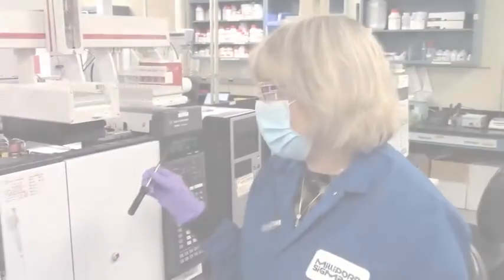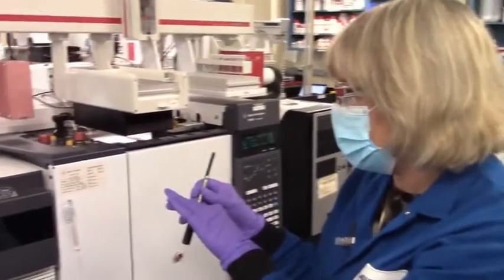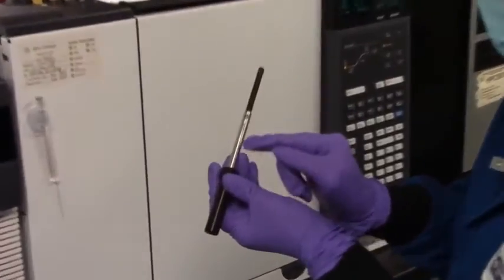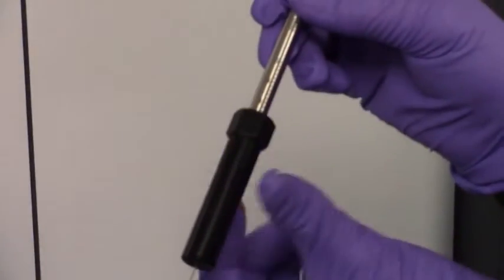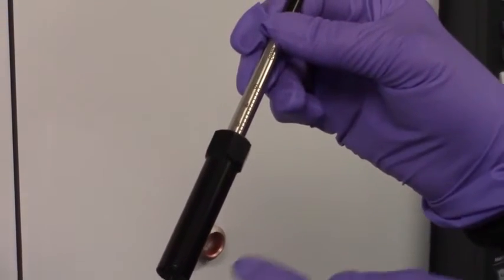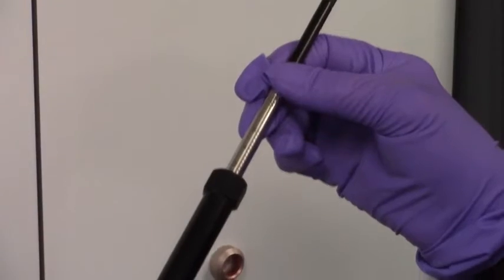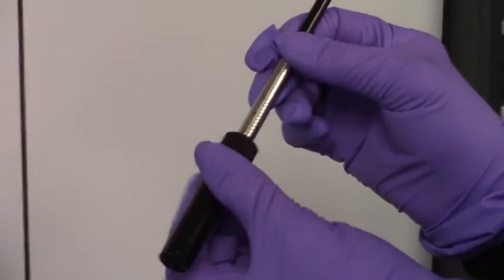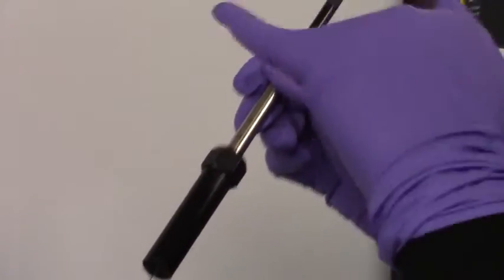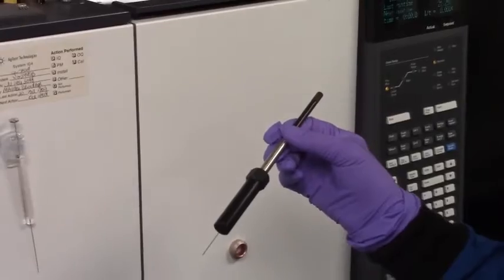All right, so I'm over at the GC-MS system now that I'm going to use for the analysis. So I've got the fiber that we just exposed to the sample, and there's a gauge here, we call it a depth gauge, and what I'm going to do is twist this big black plastic piece until I have my needle at the proper depth for the type of GC I'm using. Now this is an Agilent GC, and we recommend setting the depth gauge at 3. The reason being is that when I expose the fiber down in the inlet, it's going to be in the hottest part of the inlet, so you'll get the most efficient desorption.